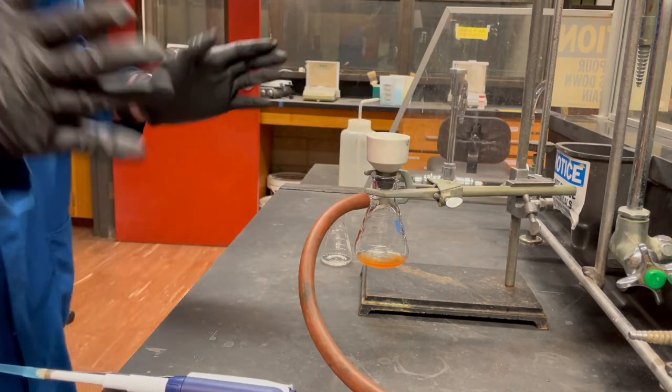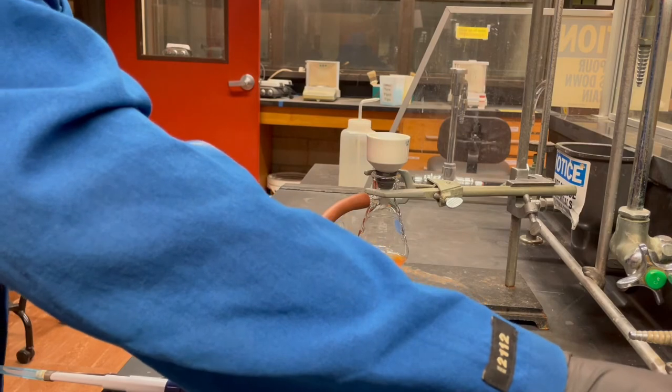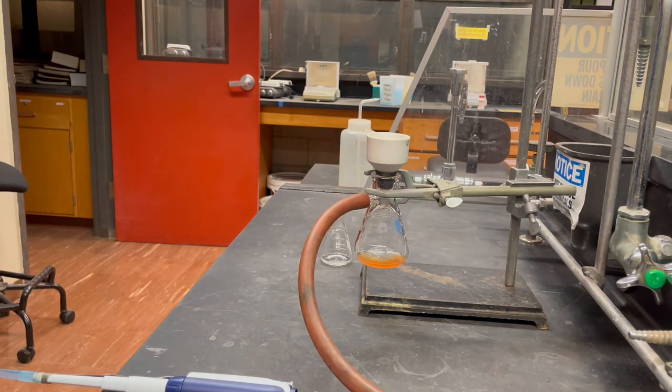But, so, that's it. I filtered it. I rinsed it. I'm gonna go ahead and let that sit in the drawer, and then we'll see ya.